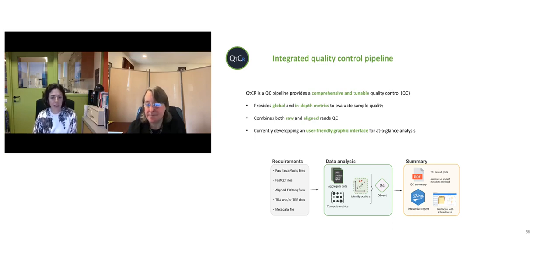So what you would need to do that: you will need to have all the sequencing files, so the FASTA files or the FASTQ files. We also need to have the FastQC files that will be used to integrate the information of the basic sequencing quality. We also need the aligned files, so that we have the output after the alignment: the identification of the V genes, the CDR3, the J genes, their abundance, the sequence at the nucleotide or amino acid levels.